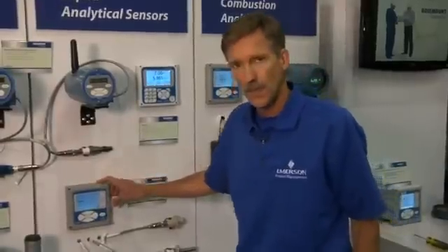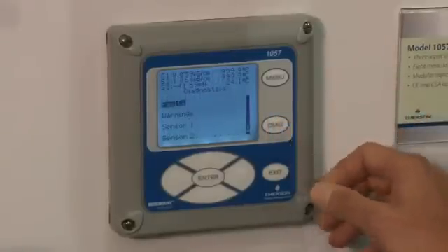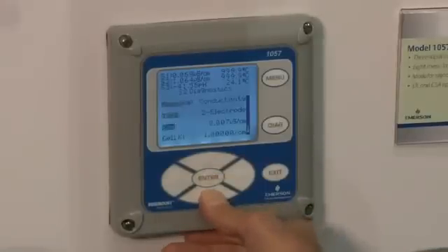The other feature I'd like to talk about with ease of navigation is the ability to diagnose a problem using the diagnostic feature of the Model 1057. By pushing the diagnostic button, you can quickly determine the condition of any particular sensor input by pushing buttons on the unit and scrolling down.